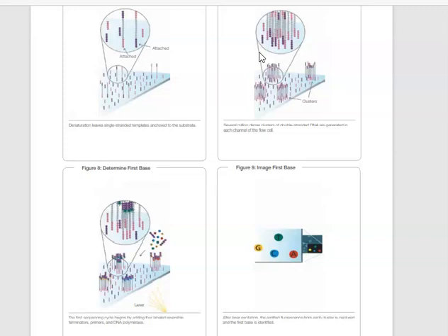So once we get to that point, again, there's a lot of steps missing, but we can make that single-stranded, and then we can start adding in the fluorescent labeled bases and then do base calling for each cluster. Now we're doing this on 100 million clusters on a single flow cell simultaneously, and that is how we get so much data generated. So at this point you've seen the bare basics. It's worth having a look at the video and also having a look at the slides, because I've explained each point sort of point by point.